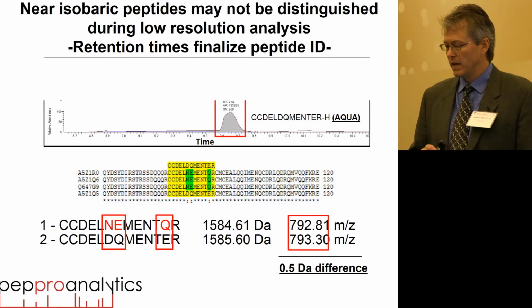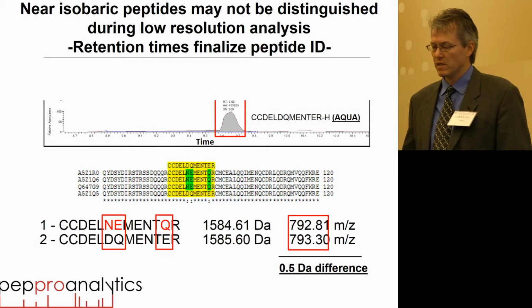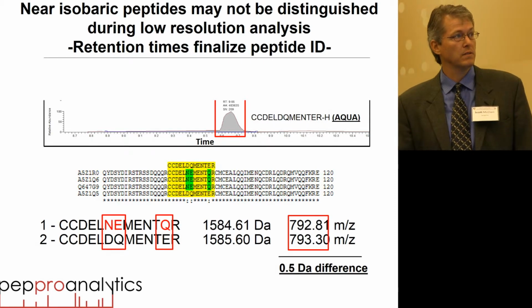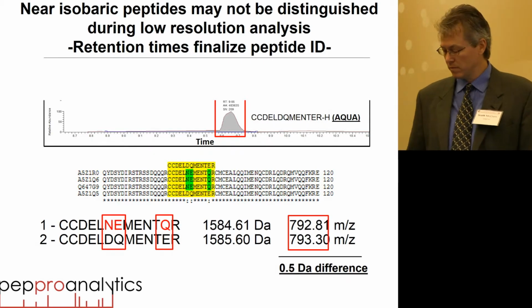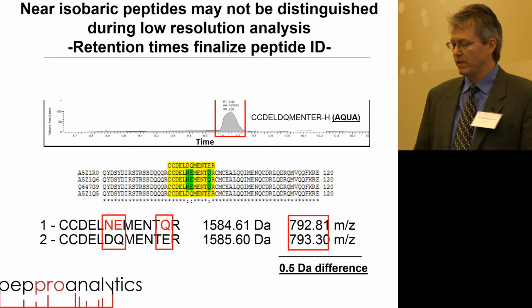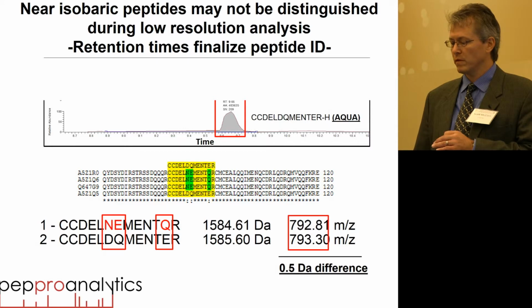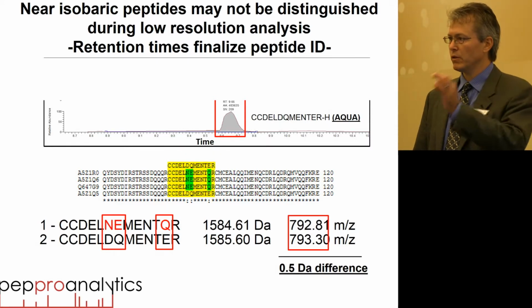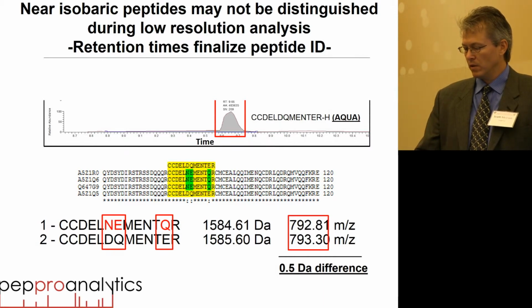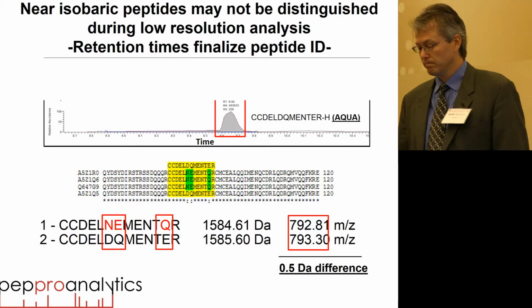And so right here, they're verifying that the sequence itself is the same, and in this case, the example is showing something that's different by 3 other peptides, and that will separate away from the one of interest. And so I think the point here was just to give you a feel for the selectivity and the specificity in terms of starting with a very complex matrix, but zeroing in on exactly what you're interested in. And so, again, just zeroing in on the one of interest and being able to discriminate, in this case, just a half Dalton difference.